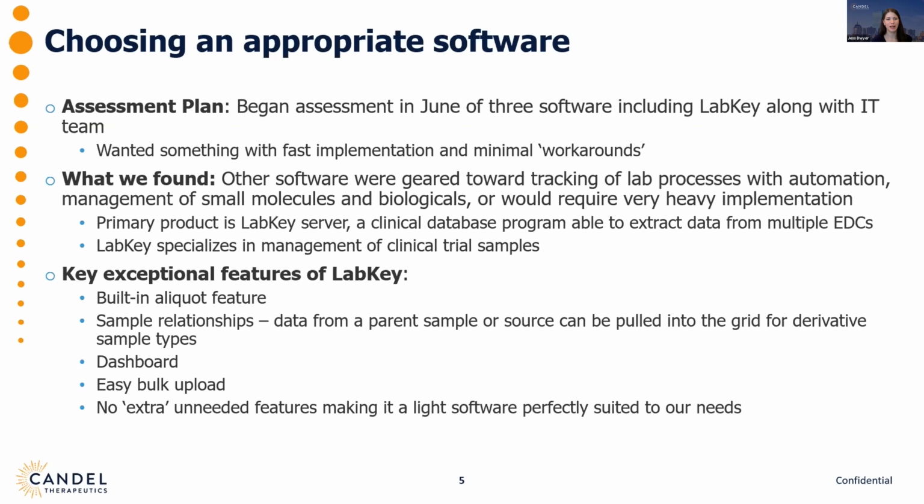And the dashboard, I think, just adds a nice visual feature that some companies will charge you to put together. And the straightforward bulk uploading I also found pretty easy, and it makes it a lot easier to get our thousands of aliquots into the database. And finally, because the software is such a good fit for our application, it just didn't feel like it had so many extra features that would make it feel bulky or difficult to navigate.